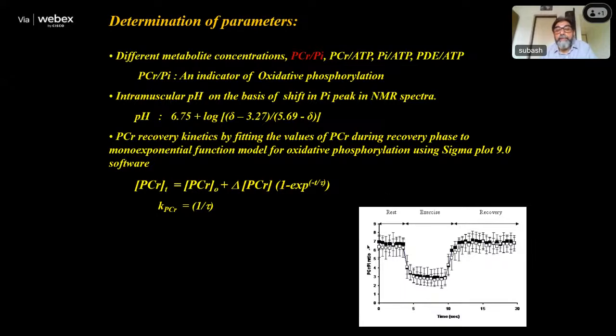So this is the kPCR. You can measure the recovery. This is the resting, and then the exercise, and then the recovery process. You can monitor these values continuously.